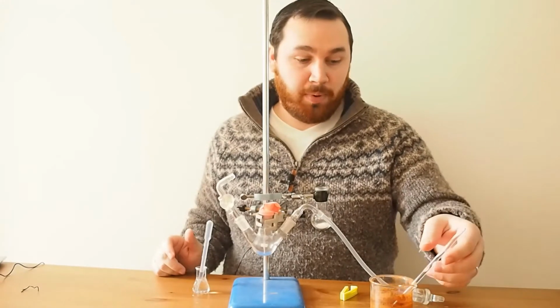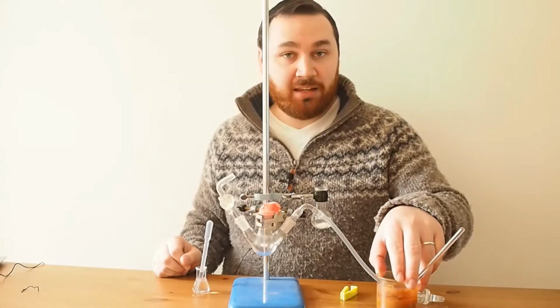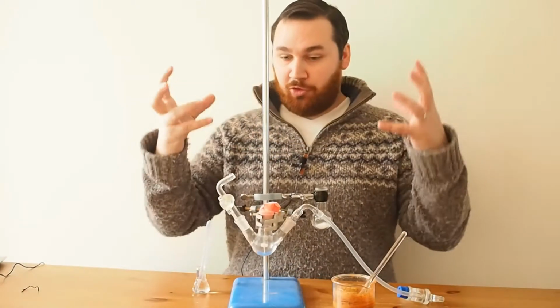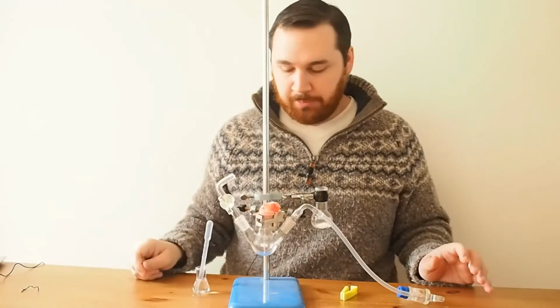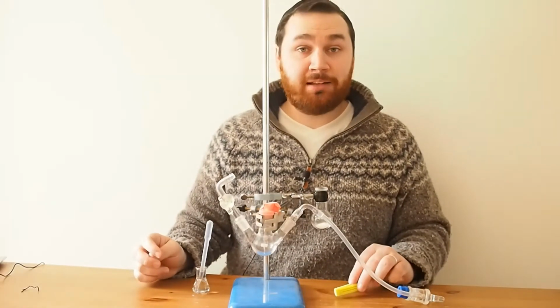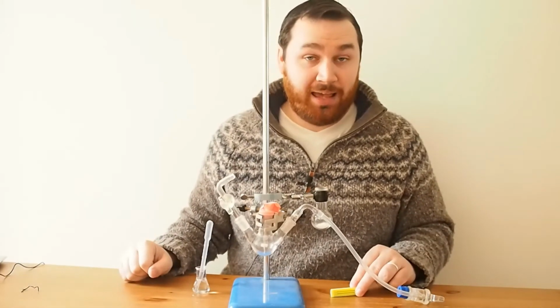So it's iron, the metal, Fe on the periodic table, and I've been coordinating it to some ligands. And ligands are just species that can dissolve or help coordinate up a metal species, but I've been having a bit of problems with it. And one of those things is that some of these metal complexes, they react with air. They can react with oxygen in the air.